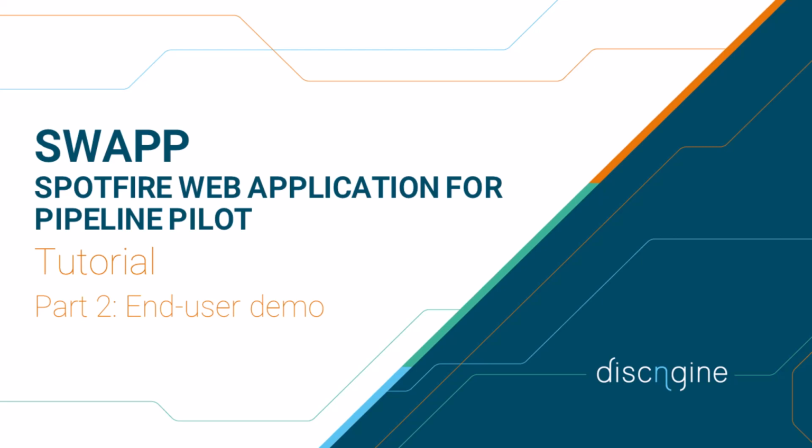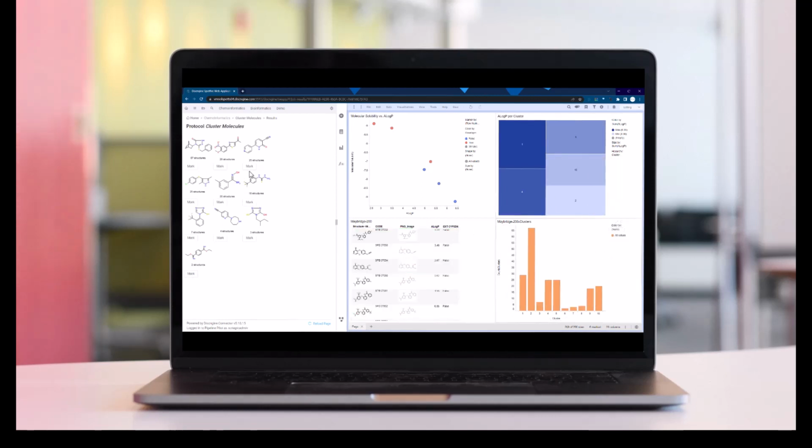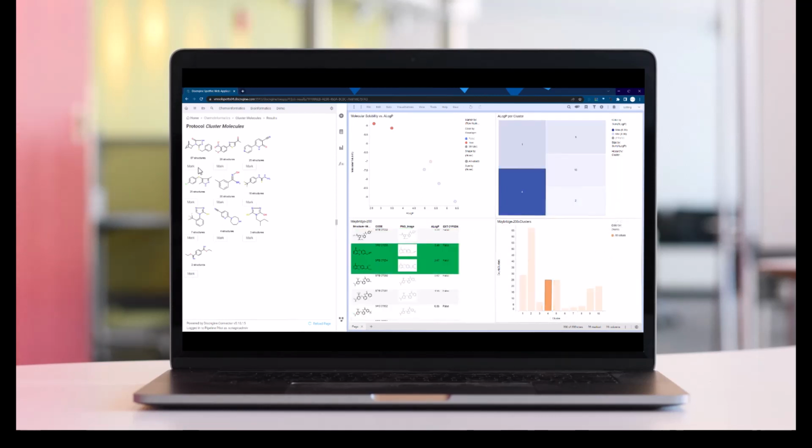Welcome to part 2 of the video tutorial about the SWAPP, the Spotfire web application for Pipeline Pilot by Discngine. In this video, you will see how end users can benefit from the combination of Pipeline Pilot and Spotfire in an integrated user interface.